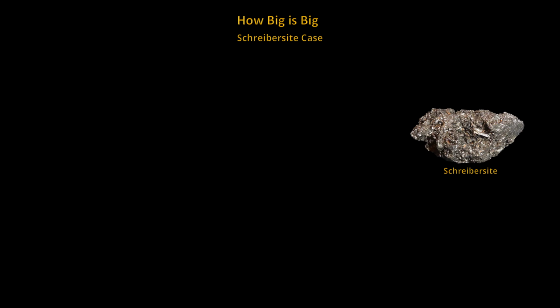For small-scale miners, prospectors, and hobbyists that conduct their own experiments at times, their biggest question is, how big should my sample be for chemical analysis? Well, the gravimetric factor is the tool to use to answer this important question.